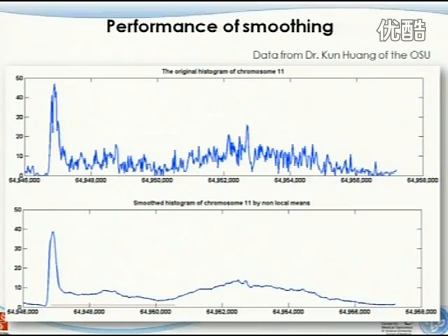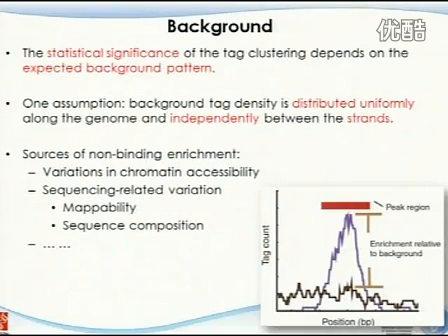And if you see there's a big peak around here, followed by a sharp dip, that really doesn't mean anything. It's just noise on top of the real signal. So once you do this window size smoothing, that will potentially help you recover the original signal in much greater detail. Okay, that was my explanation. I'm not sure she bought it, but it seems that she got it.